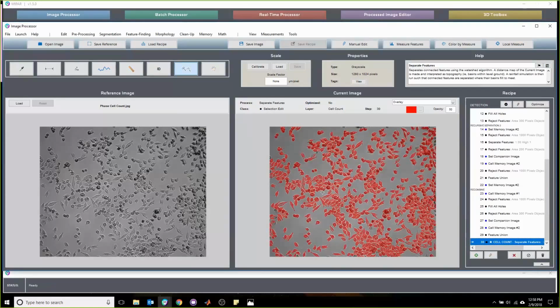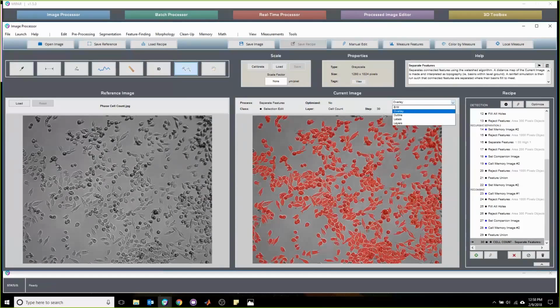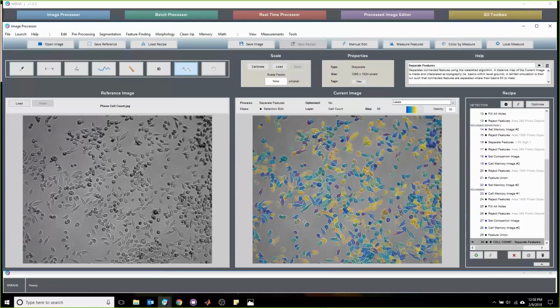To help separate these smaller clumps that would not have been separated before. So if we go in here, into our labels view, we see this is done fairly well. And I'm not going to pretend like it's perfect, because it is not. But if you were to sit down here and try to quantify this manually, this automatic quantification is well within the margin of error when compared to manual quantification of high throughput imaging.